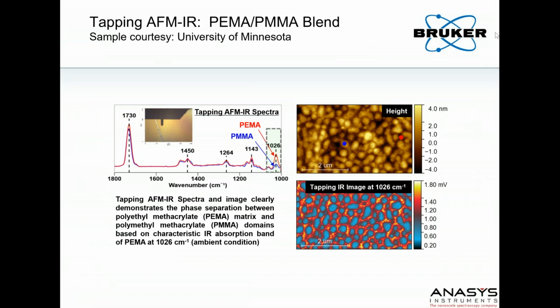Okay. Thanks, Dean. So before I get into some recent publications, I want to give a couple of examples of the new Tapping AFM-IR. The first one is a blend of polyethyl methacrylate and polymethyl methacrylate. So these are very similar polymers that have very similar spectra.